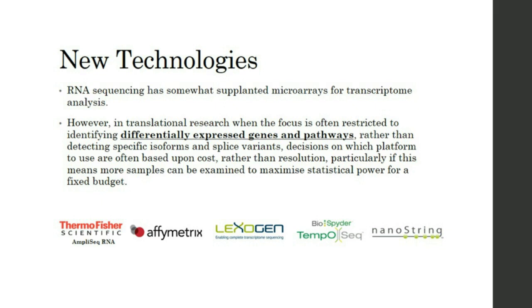However, full RNA sequencing is not without its challenges and associated costs. And as translational researchers, we are often interested in differentially expressed genes and pathways, and really integrating the transcriptome. And fortunately, there are now a range of new and emerging technologies which seek to address this problem. And we essentially wanted to find the most appropriate technology for our purposes, and so set about testing various available technologies in terms of their ability to produce robust and usable data.